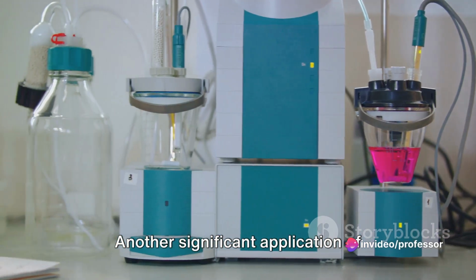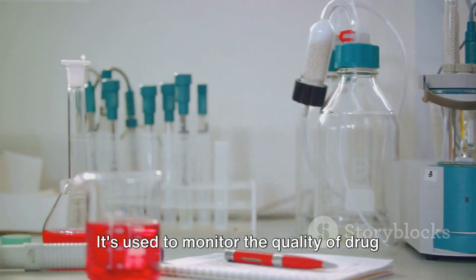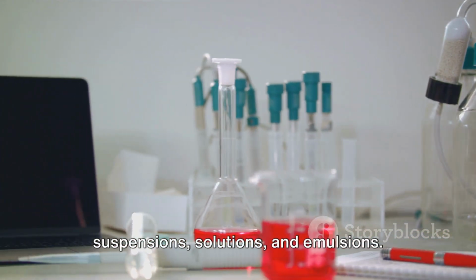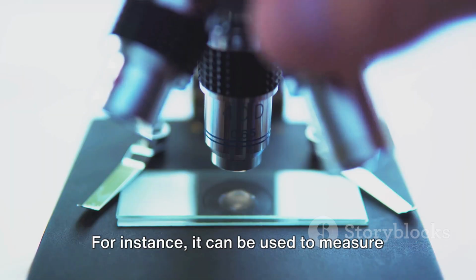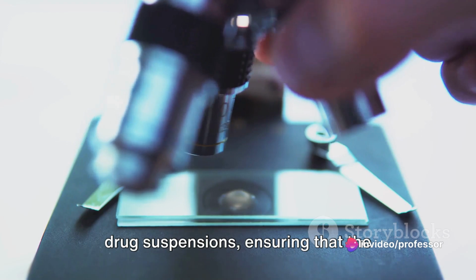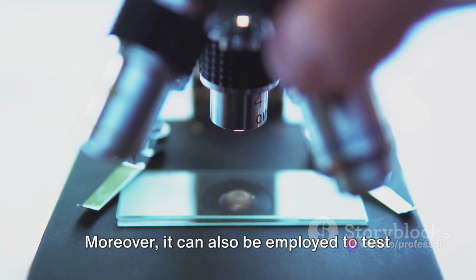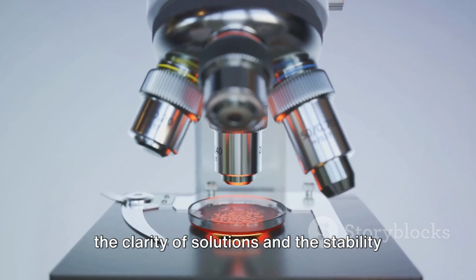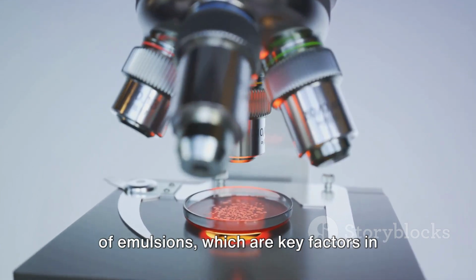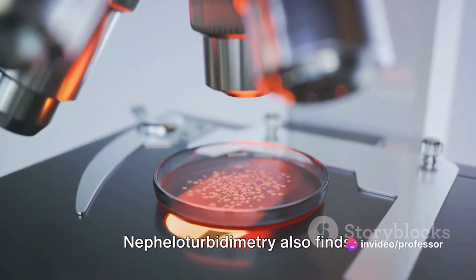Another significant application of nepheloturbidimetry is in the pharmaceutical industry. It's used to monitor the quality of drug suspensions, solutions, and emulsions. For instance, it can be used to measure the particle size and concentration in drug suspensions, ensuring that the formulation is accurate and safe for consumption. Moreover, it can also be employed to test the clarity of solutions and the stability of emulsions, which are key factors in determining the quality and effectiveness of medicines.